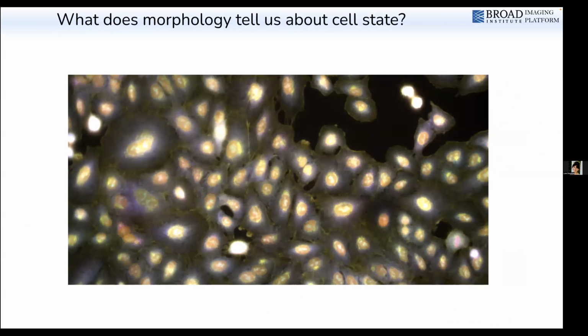So selective use of imaging, where we use tools like CellProfiler to measure specific features or identify specific phenotypes we care about, is impactful, but we know that there's more than a single readout or cell phenotype that we can get from an image. In fact, in the field of image-based profiling, we argue that by collecting hundreds of readouts from pictures, just like what you're seeing on the screen right now, we can capture a surprisingly expansive view of cell state that can help us probe biology.